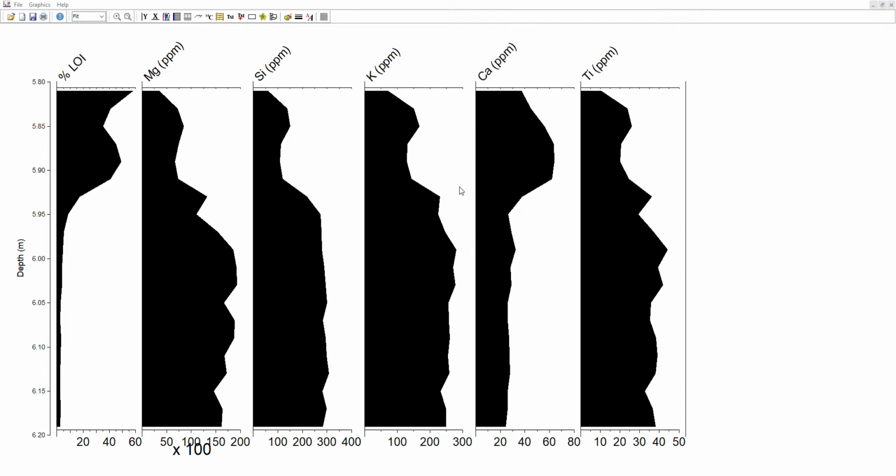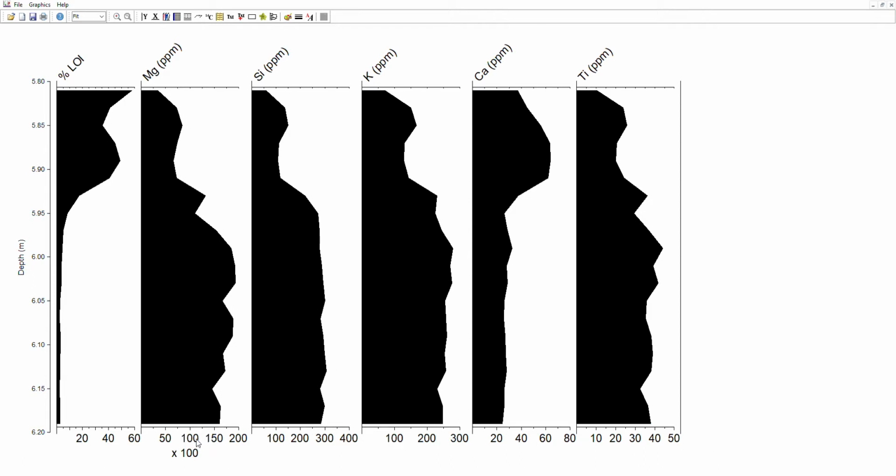We'll click on that drop down box, click on this drop down arrow here, and that gives us the font size. It's 36 at the moment, we'll go 25, OK that, and OK that, and that's moved that down nicely, and it's now the right size as well. You can repeat that for these other 3 curves as well.